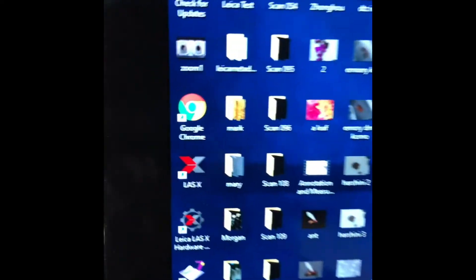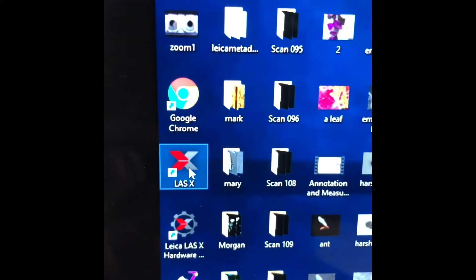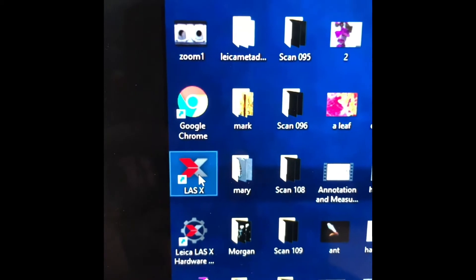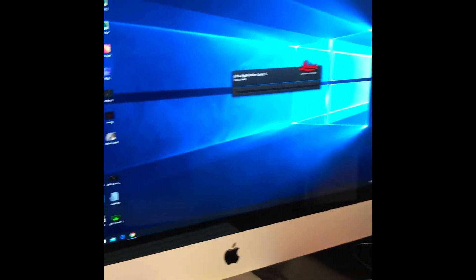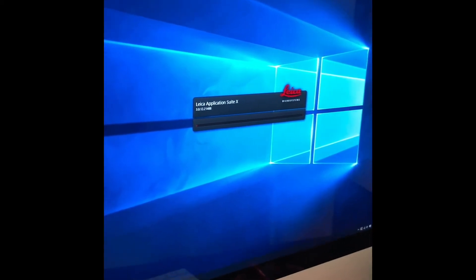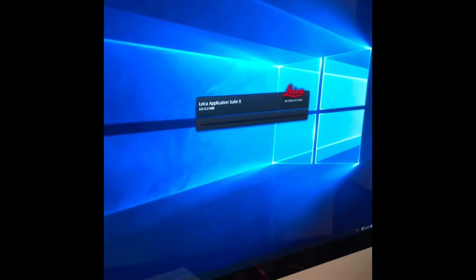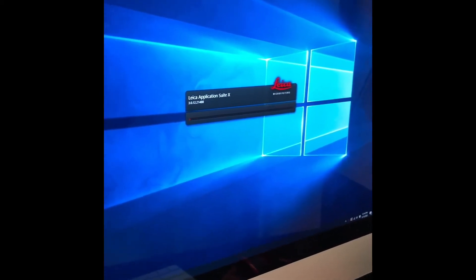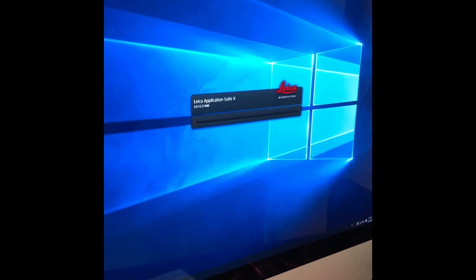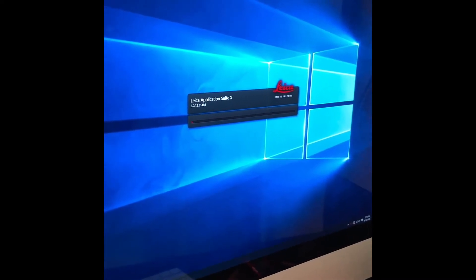Then we're going to go over and start the LASX software. It'll then start to go through its progression of opening up the software.